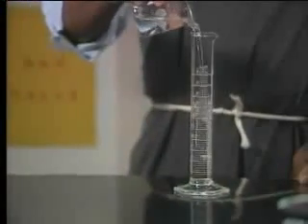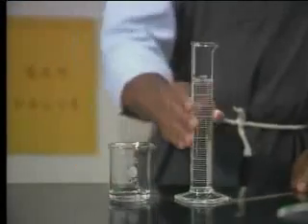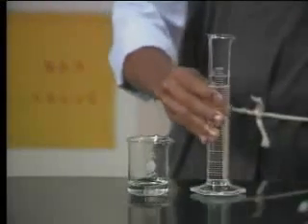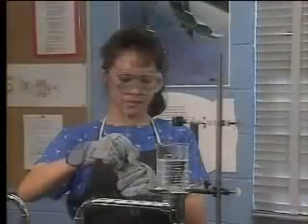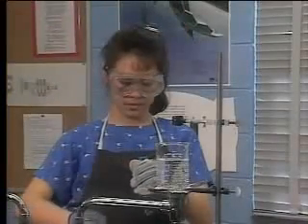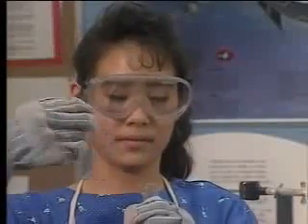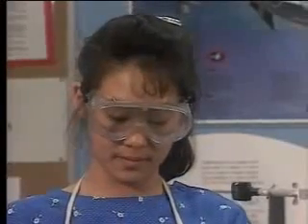When handling chemicals, always keep them away from your face. Never taste anything to see what it is, and don't touch it or smell it directly from the bottle either. Small amounts of some chemicals, even vapors, can harm your eyes, mouth, and nasal membranes. There's a safe way to smell a chemical indirectly, if your teacher gives you permission. Hold it away from your face and waft the vapors to your nose. That way you won't get a strong whiff of them directly.